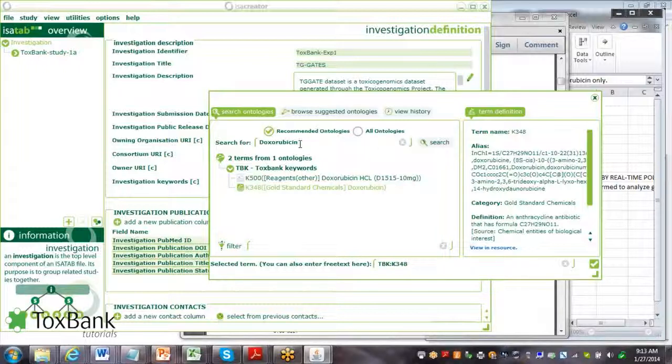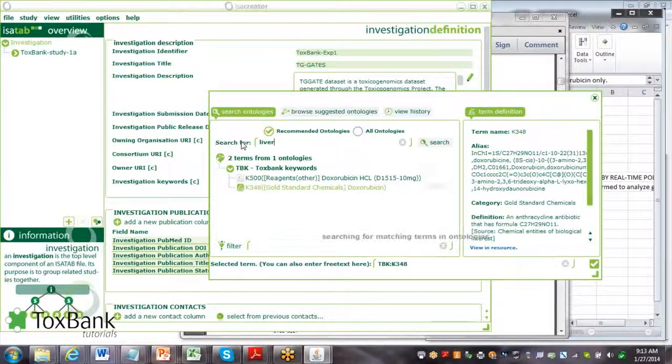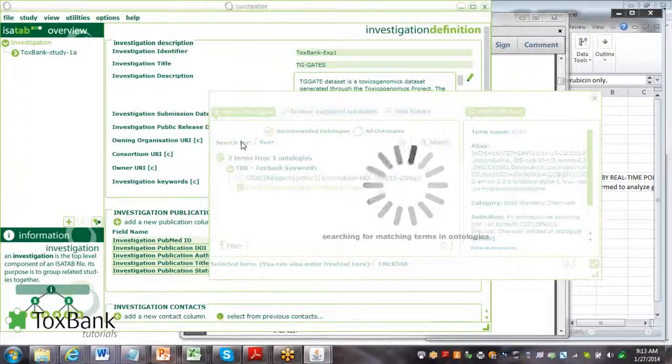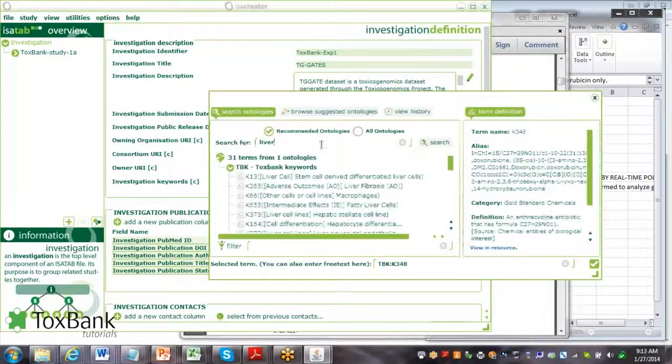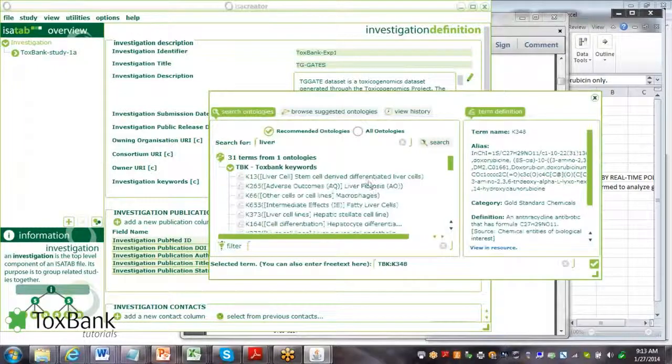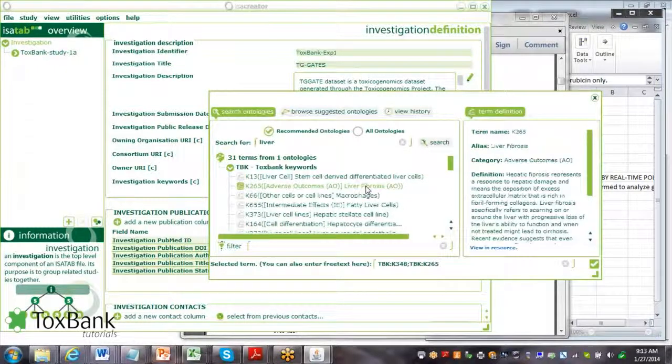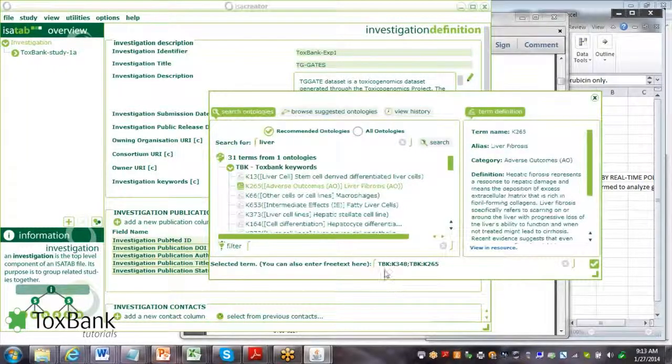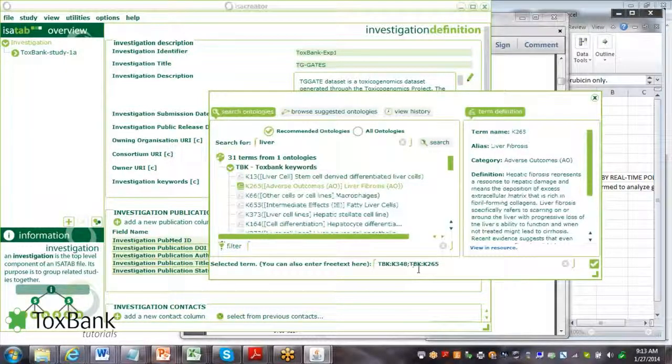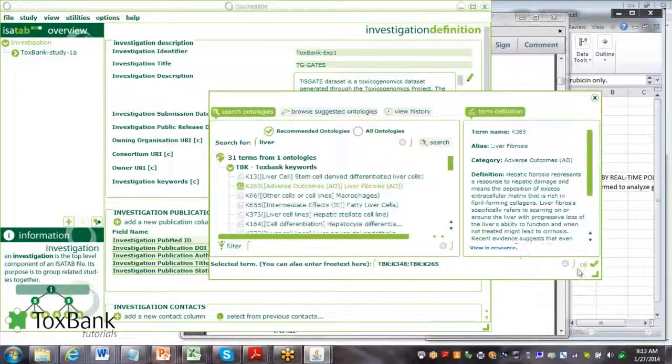If you wanted to search for other keywords, you just do a search, identify the keyword that you want to add, and here you can see it's added this to the list.